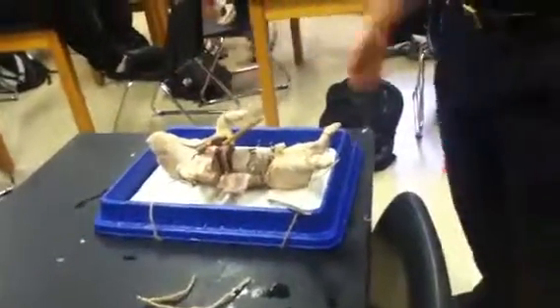Yes. So this one would be bigger than like a cell? It would what? It would be bigger than a cell? On this page? Yeah, in calves and piglets, the thymus glands are huge. But if we look for them in the adult, it's really hard to find. So we could find your thymus gland. But mine, probably if you dissected me at a medical school, you probably wouldn't find my thymus gland.